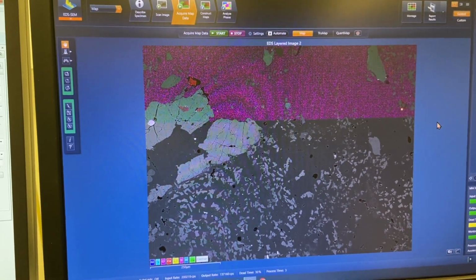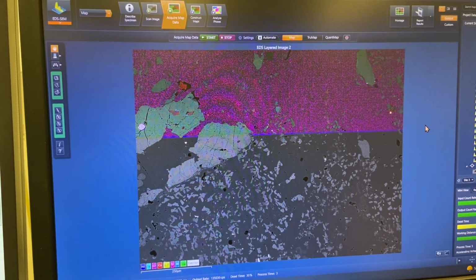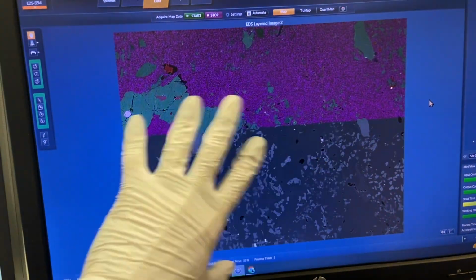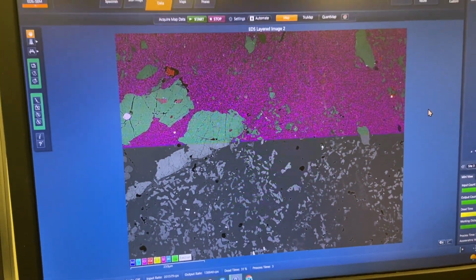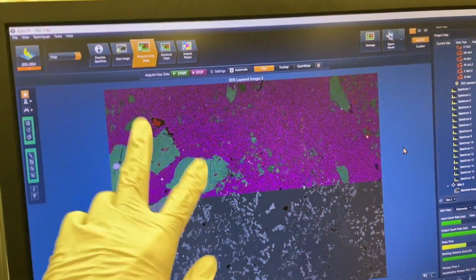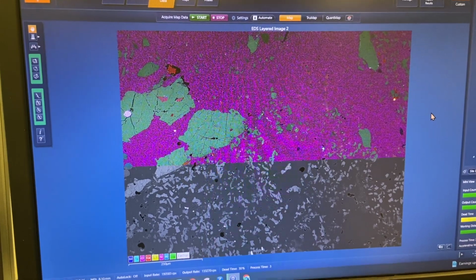But really, I'm just trying to understand, when you're forming these breccias and you're forming these meteorites, you're disrupting and you're creating all sorts of physical, chemical modifications of these initially pristine clasts. And look at this, all of a sudden it's been altered, it's been broken up. If the melt around it's hot and this stays warm, you can get diffusion of elements, so equilibration. You can get all sorts of processes in these things, and it's important to understand what effect each of them has, because a lot of studies try to look at clasts and say, is this pristine, is it not pristine? Evaluating pristinity is a very difficult thing, I've at least noticed while reading a lot of materials on lunar samples.